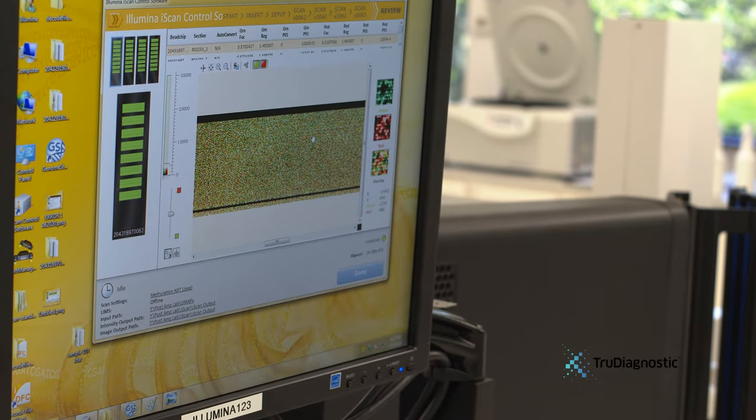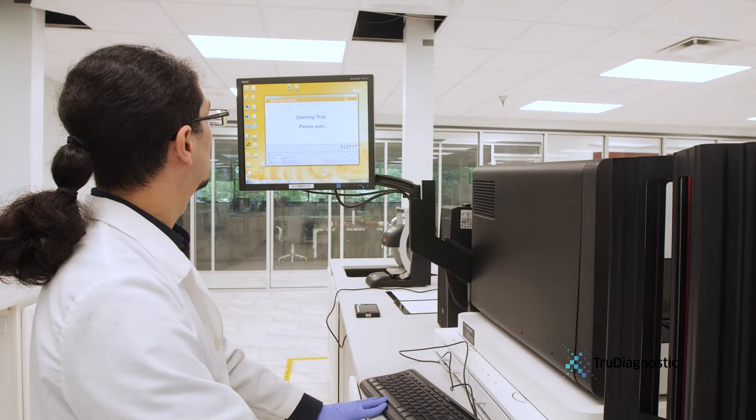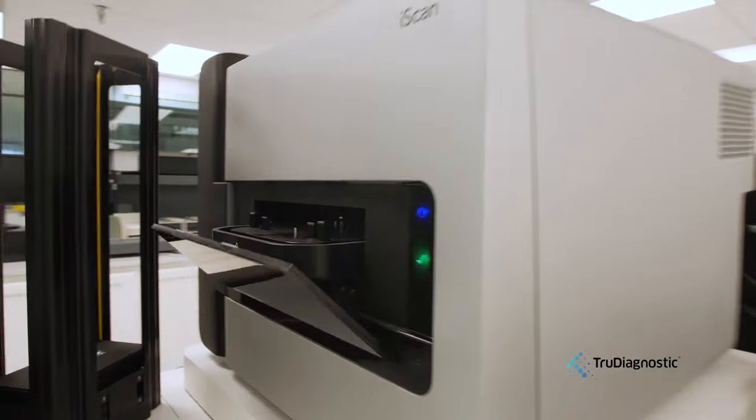But when you add the auto-loader, you can have several stacks of these four bead chips and it will automatically load each stack into the machine for you, which obviously makes the process more efficient.